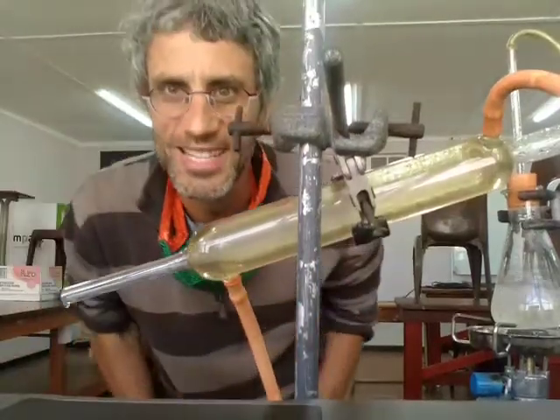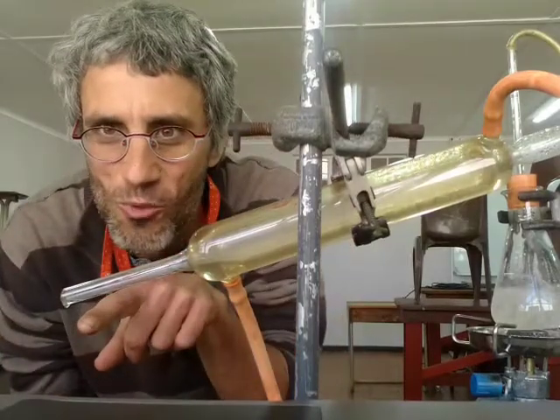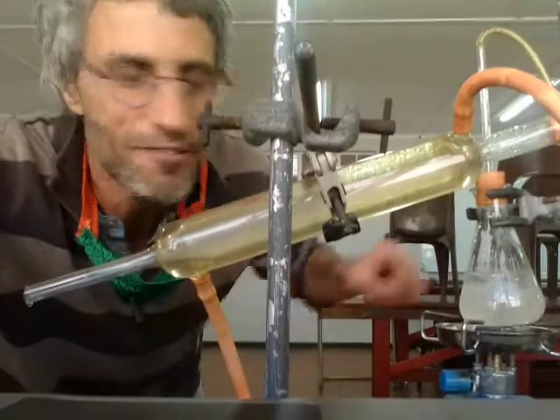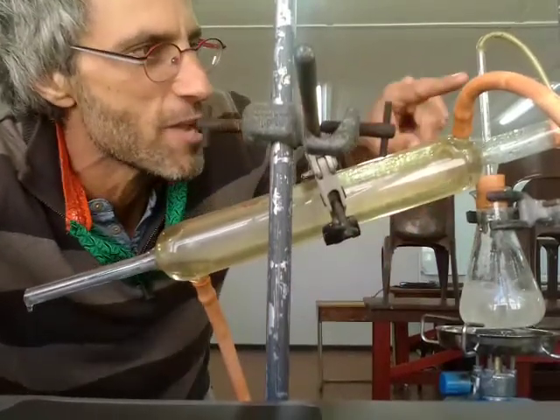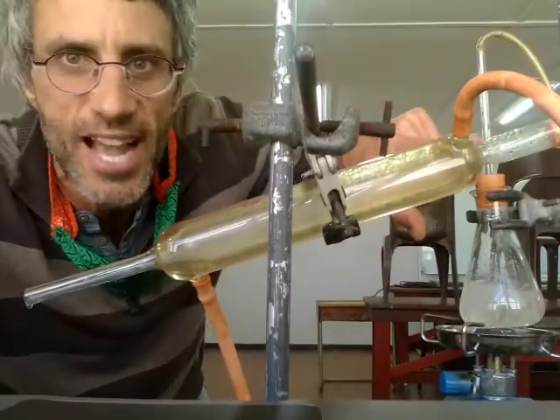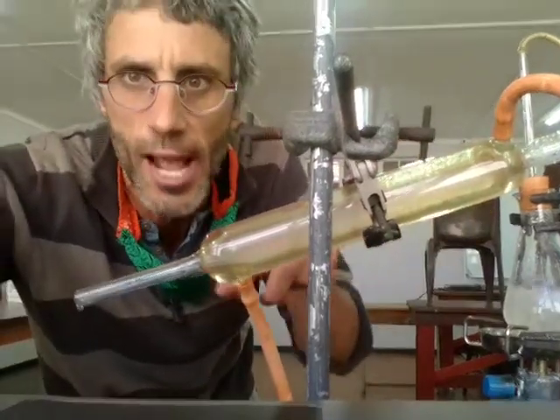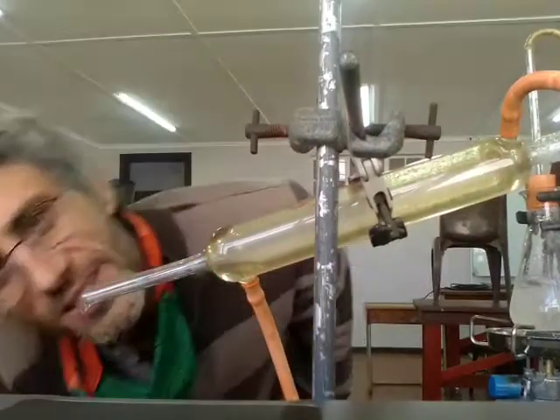I'm just going to pause this because I don't want to spend too much of your time. Okay, we've got some success here. You can see the drip, drip, drip of water dripping here. Spin you around. You can definitely see the bubbling here. The water vapor goes inside. It actually even condenses a little bit here. But most of the condensation happens here. And drip, drip, drip. Let's taste.